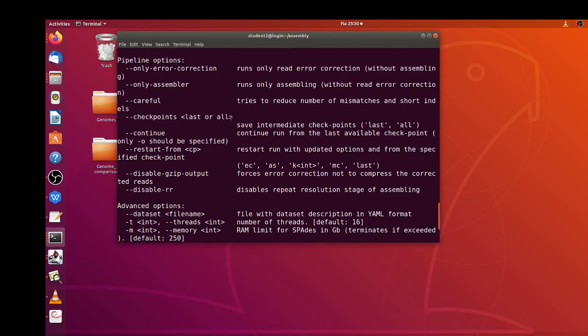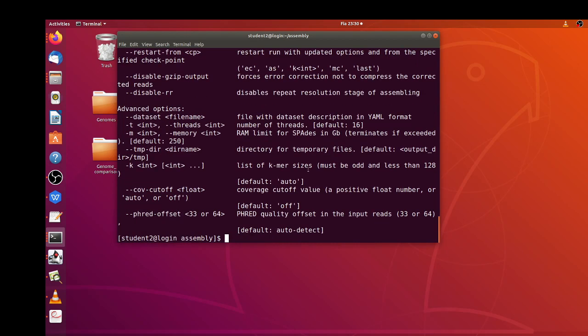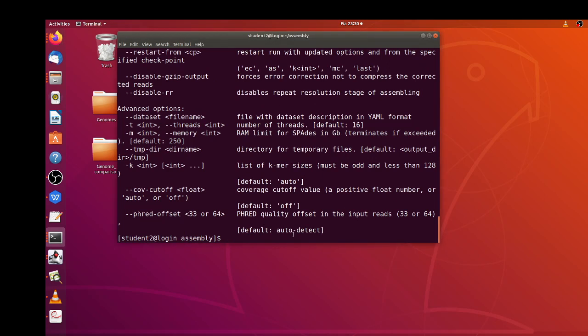Okay, so let's proceed now that we have tested. Let's proceed with the de novo assembly. You have to add the inputs as well as specify an output directory and then some other options depend on what you want. So you use a simple command: spades.py --careful.